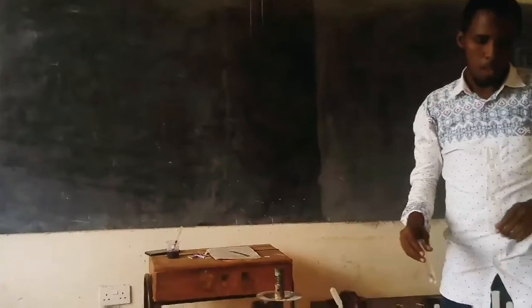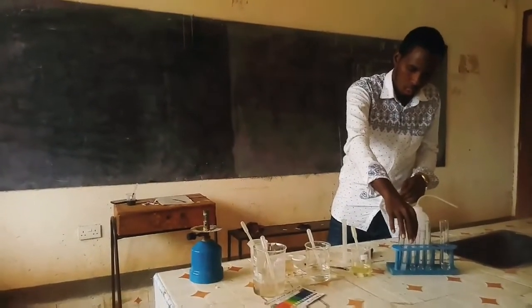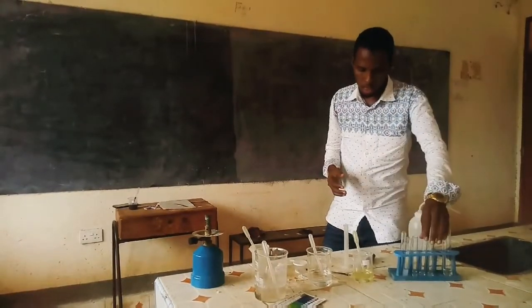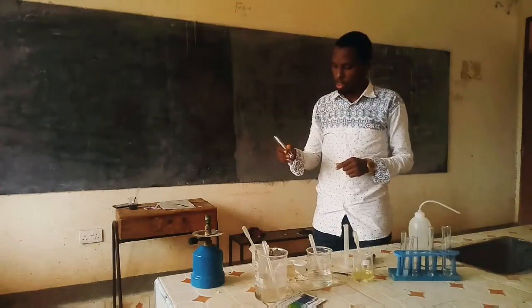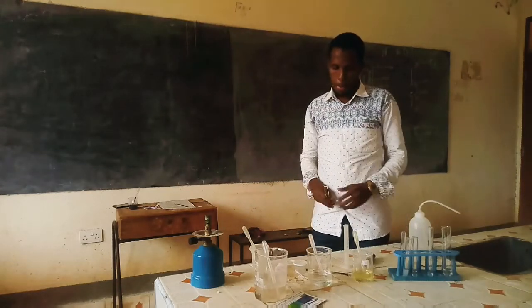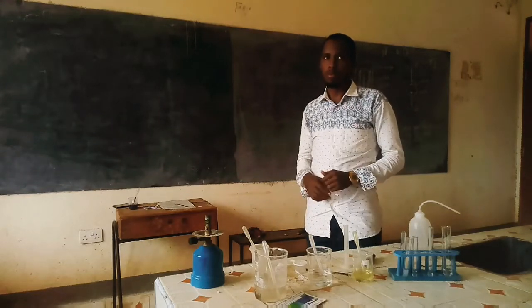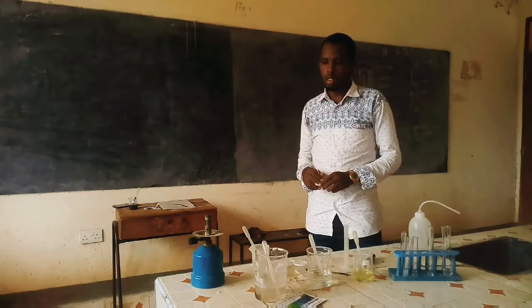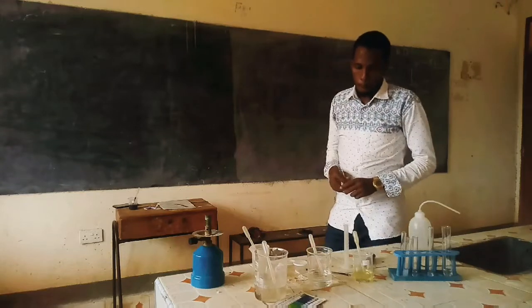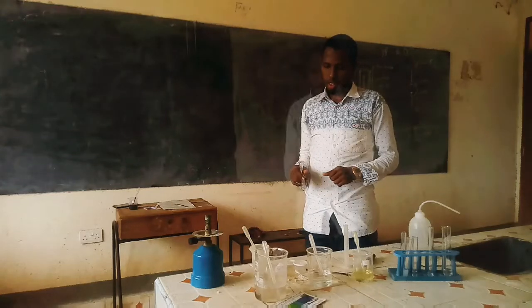Very good. Now, remember sodium chloride tests 2 cations, that is lead and silver. We are not supposed to mention silver because we have already mentioned magnesium, aluminium, or lead. Therefore, the correct inference is either magnesium or aluminium ions present. Lead is absent. Why? Because lead forms a white precipitate with sodium chloride, and since we obtained no white precipitate, lead ions are absent. So magnesium or aluminium ions present. Very good. Now let us go to the third portion.